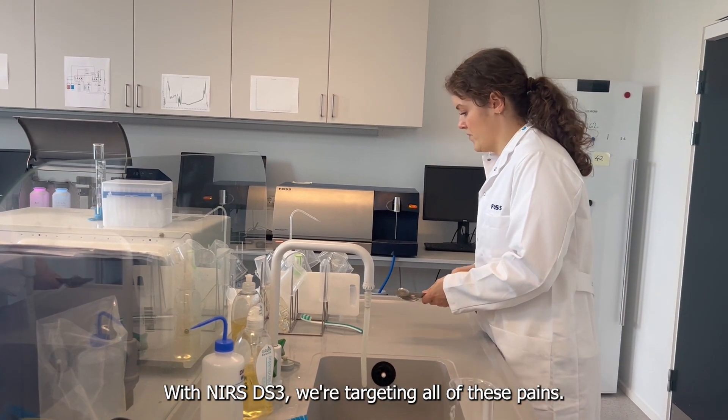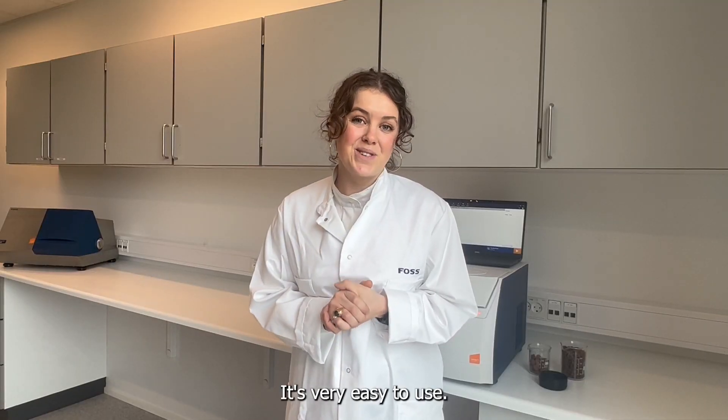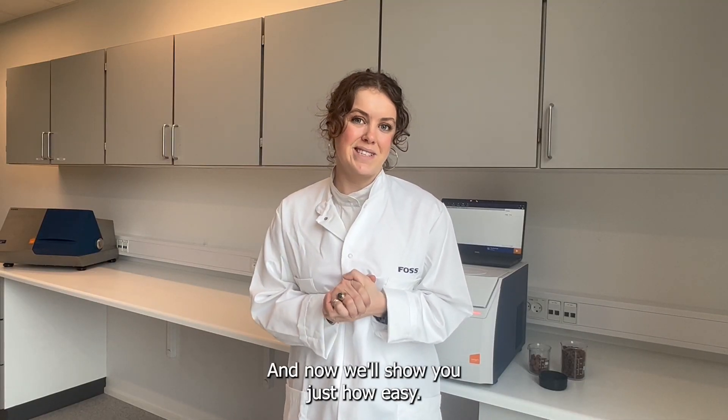With the NIR DS3, we're targeting all of these pain points. It's very easy to use, and now we'll show you just how easy it is.